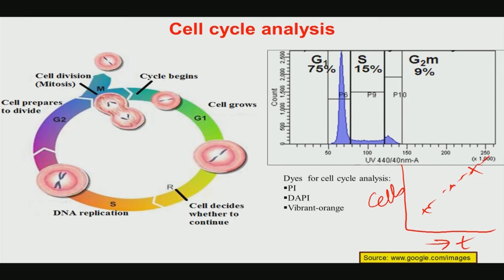That certainly shows that cells are growing, that means cells are dividing. But you do not have any clue from the simple MTT assay about what fraction of the cells are in different stages of their cell growth. You just have a rough, overall idea that this number of cells is growing while attached to the biomaterial substrate.